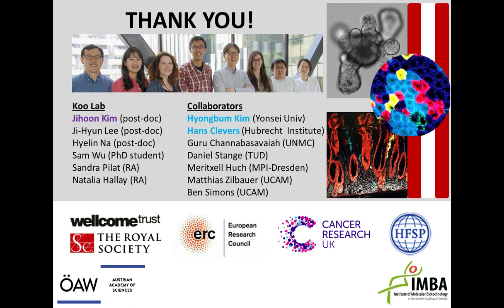Whereas if you do that ex vivo, then you just want to find out the correct clone after the editing trials. So in that case, I think the efficiency is not really a problem.